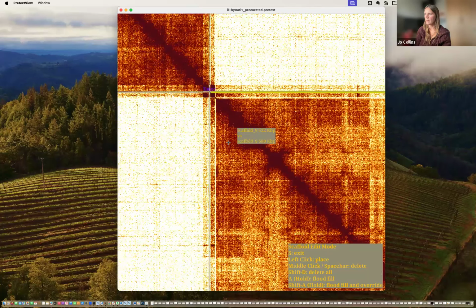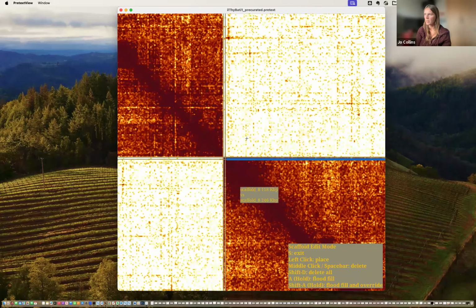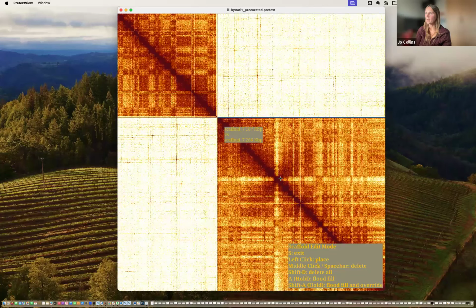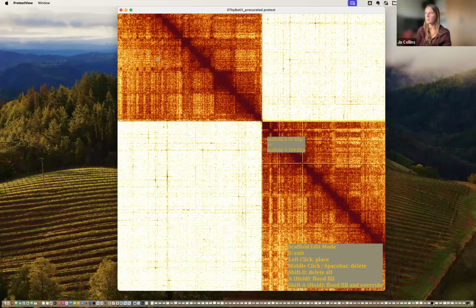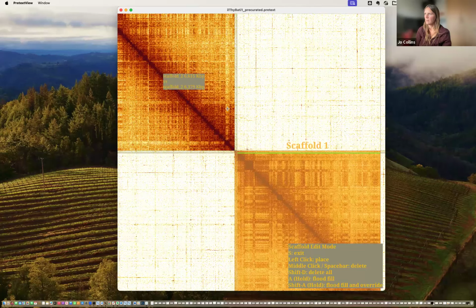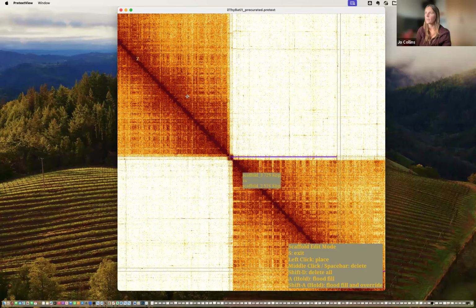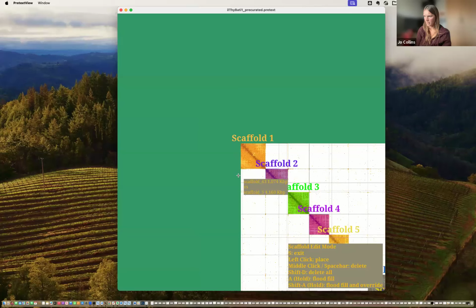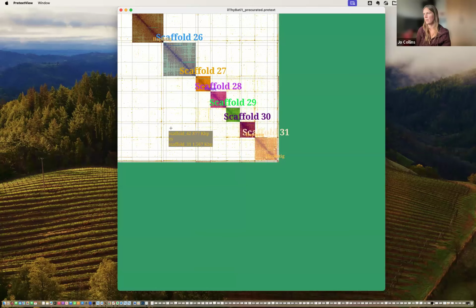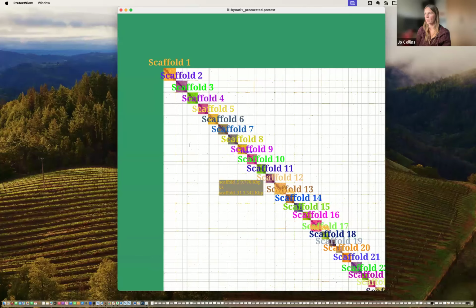So it's very easy, I think, as we can all attest, to slightly mispaint. It's another example there. And then it can lead to a whole host of irritating problems that are unnecessary. And there. And I'm just going to take S off because it's really easy to start accidentally painting things as well.